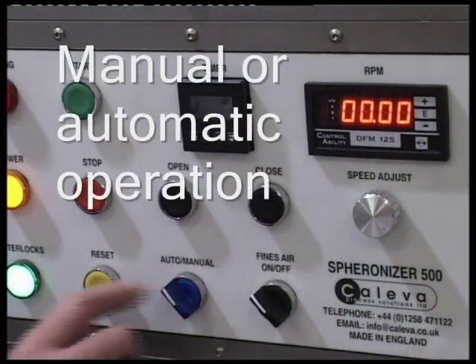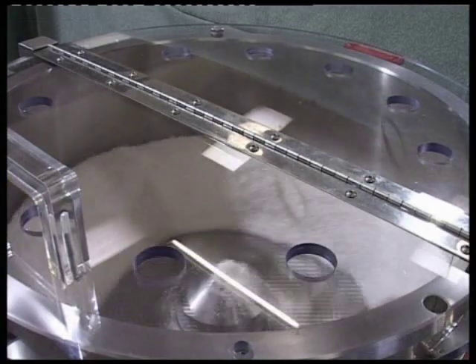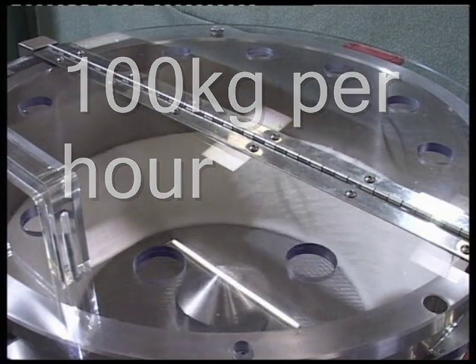The option of either manual or automatic timer control is available as required, and a productivity of around 100 kilograms per hour depending on material properties and treatment time.